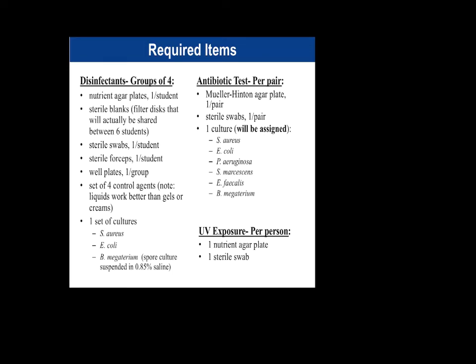So in this lab, we typically have you guys break up into groups of 4 to do this, looking at different types of antiseptics and disinfectants. So let's just walk you through overall what we're going to be doing.